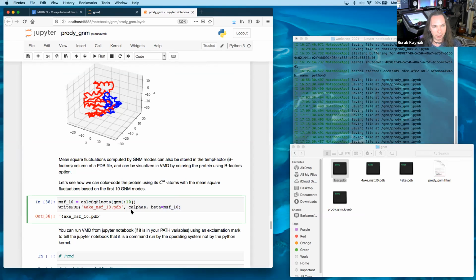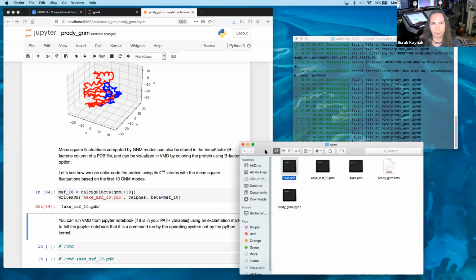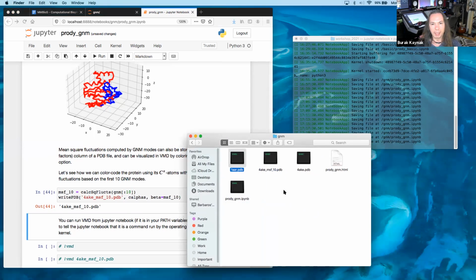Here, as you see, this is the C alpha, which means that we don't have any other atom in the structure, right? Only C alphas. And I say this, where now I have it, for example, this is my folder view, it's there, okay, it's there.